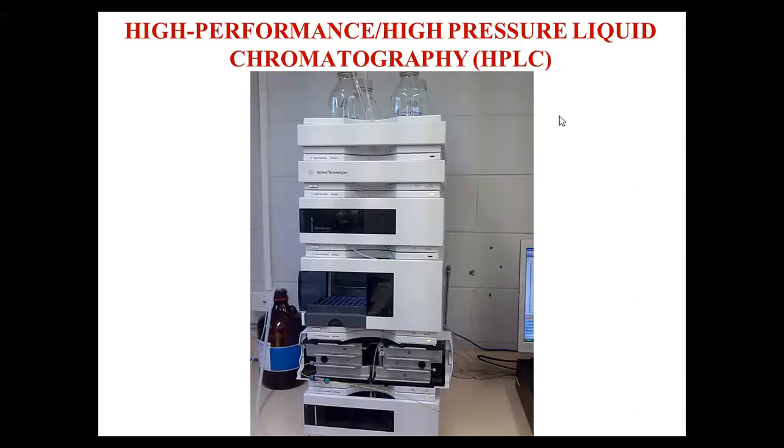The necessity of creating the pressure is to increase the flow rate of the mobile phase, and as a consequence of the increased flow rate, there is a rapid elution of the solute molecules. Therefore, we can decrease the analytical time of separation. As we succeed in decreasing the analytical time, the number of samples which can be subjected to separation by HPLC can also be higher.